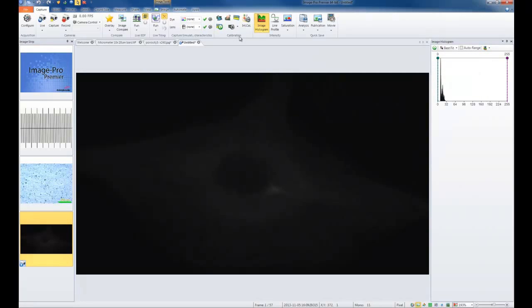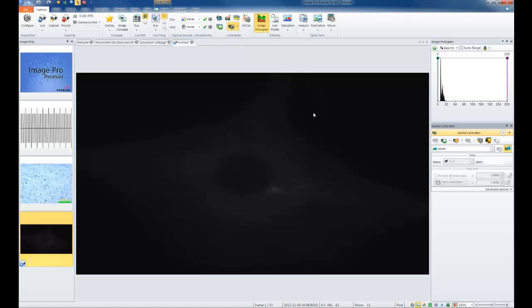Much like our previous options, if I go to my calibration dropdown, I'm able to look in the options at all the calibrations that have been created. In my simulation test, you can see that I created many different estimates based upon the lenses that we had. For your individual cameras and lenses, this will be specific to the name that you have created, so each of these will make sense to you.